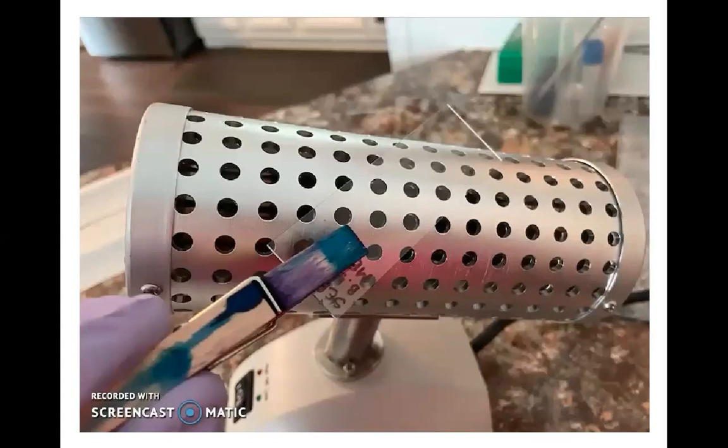If you try to stain a bacterial smear that has not been heat fixed, when you go to stain that smear, you're going to wash the cells right off the slide. So we heat fix to adhere the cells to the slide. We also heat fix to kill the cells. Now, the stain itself is going to kill the cells too. So it's kind of a double check that we've got the cells killed and stuck to our slide.